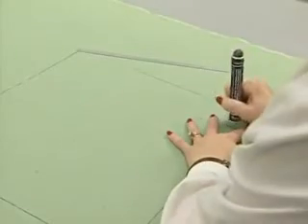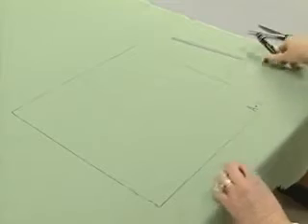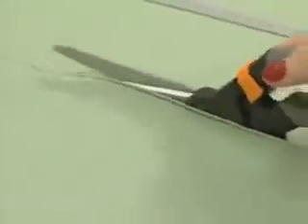Label each specimen with proper identification so it's always read in the length direction. The identification can be a combination of numbers, letters, and symbols. Carefully cut out the specimens to prevent distortion.